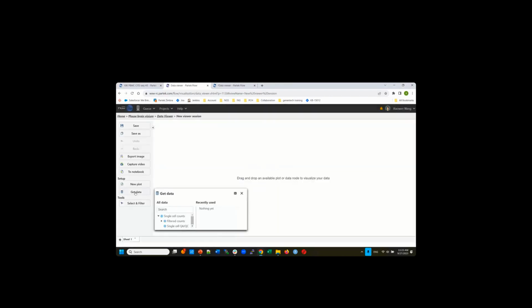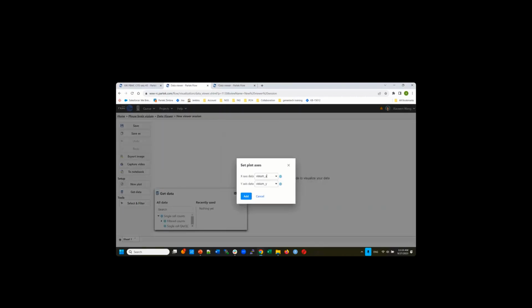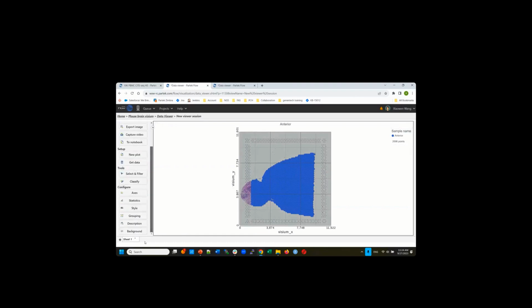Once you import the data, we'll have the spatial information. It's only 2D, and the spatial information has the X, Y location of the slides. That's the spatial image for the data, and at the bottom, you will have the background.